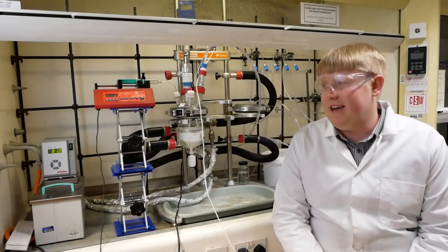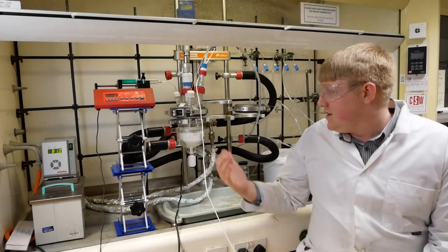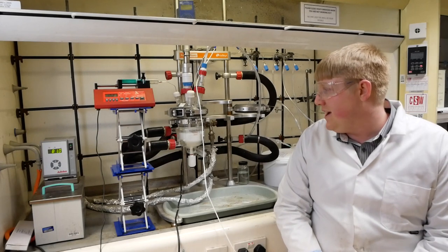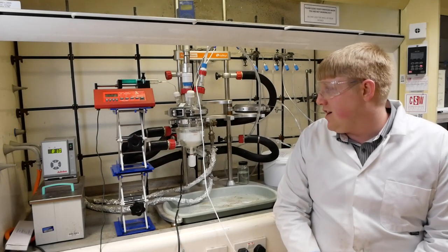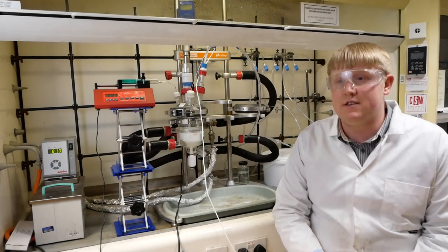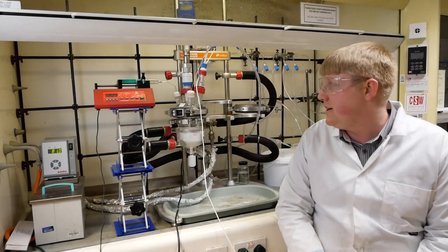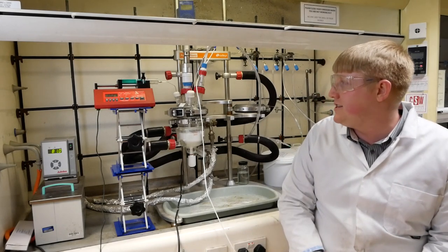One of the core technologies we use in the BonnLab is emulsion polymerization. So you can see here we have an example of one in one of our reactors. These are essentially scaled-down versions of the same reactors they use in industry. They allow us to interface quite easily with our reactions.